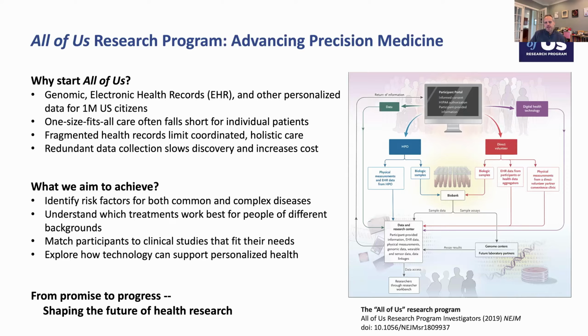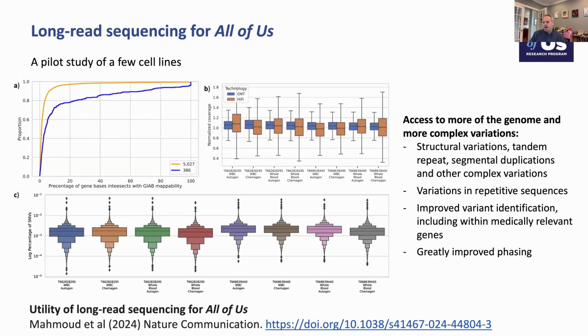This is a major initiative that's been underway for many years now. In terms of the biobanking, more than 500,000 samples have been collected. There have been different technologies applied. I should comment, the short-read sequencing, just because it got started earlier, is ahead. There are more than 500,000 samples now that have been sequenced using short-read sequencing. But I'm very excited to announce, the long-read sequencing is also starting to come on board at a really massive scale. So to get started, a couple years ago, we launched a pilot study.